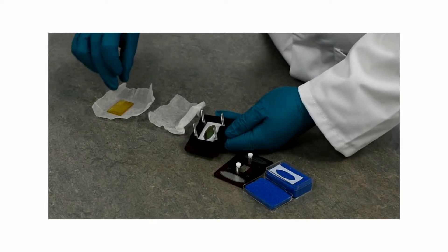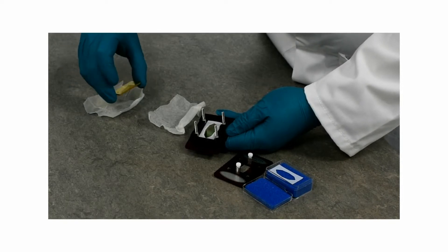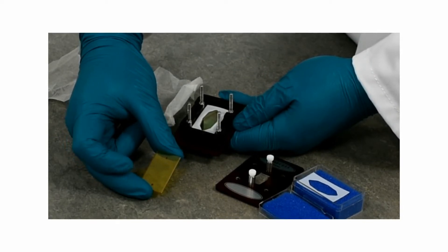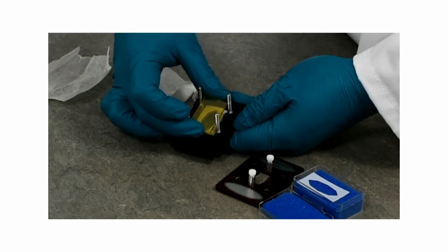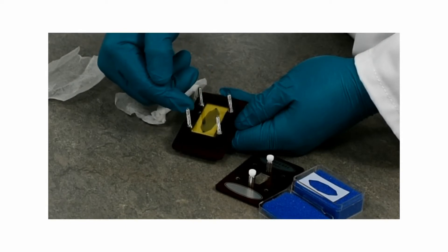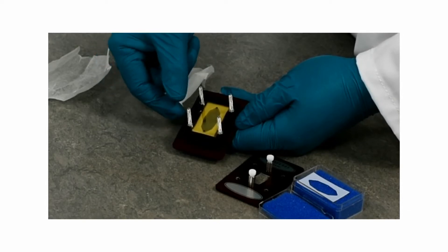You then take the front window, and what you will find is that with this window there are actually two holes drilled in it at the top and bottom for the liquid to flow in and out of your cell. You insert that into the cell, taking care that both holes are clear of the spacer so that the liquid can flow into the cell into that space you've created between the windows.